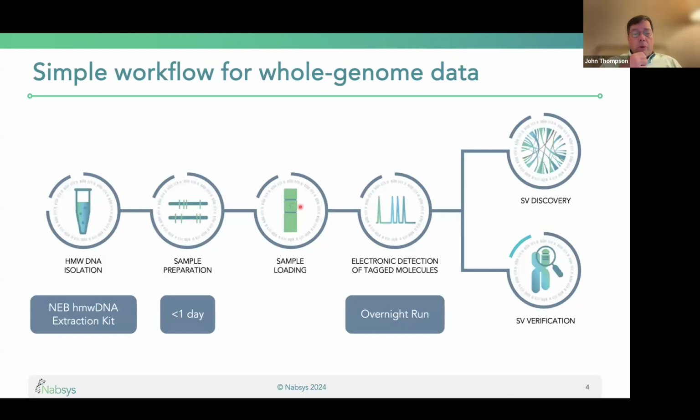So I'll go through the protocol first in terms of what you do to get the instrument, and then tell you how that data is used and what you get out of it. So the critical thing is you have to have high molecular weight DNA.